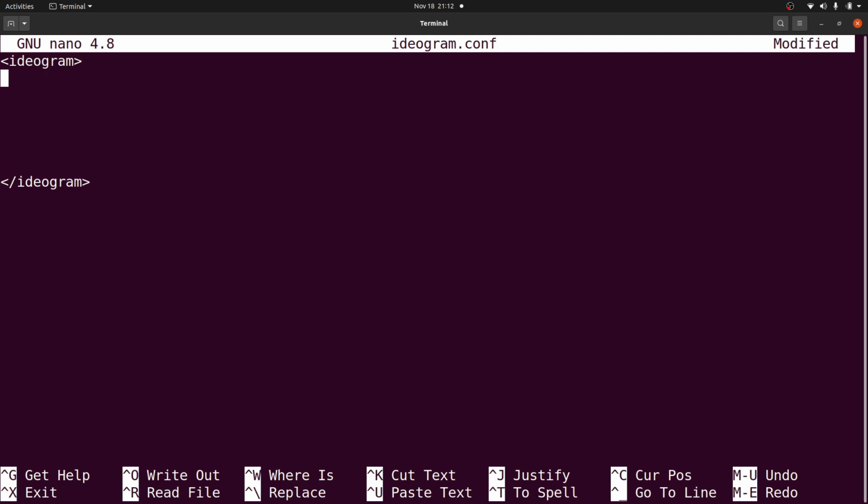So I'll start with the spacing. Spacing, default equals 0u, break equals 0u. Now I'm dealing with a single chromosome, so probably it may not be necessary, but I'm just defining them just in case. So that's for the spacing. Spacing may not be necessary because of the single chromosome.